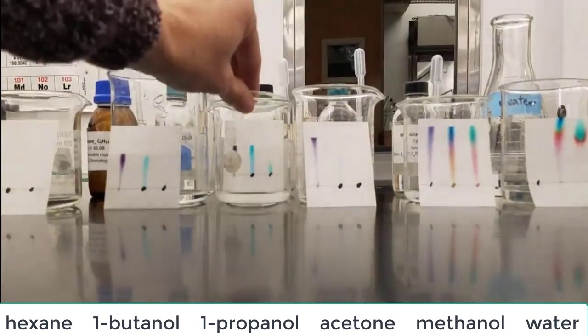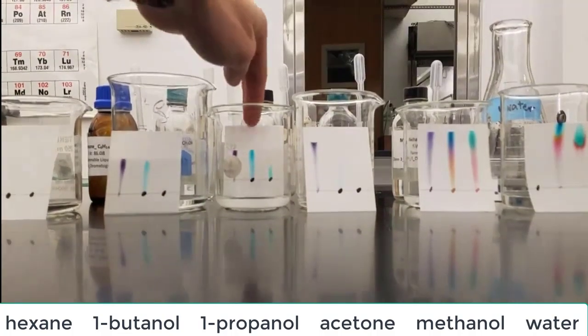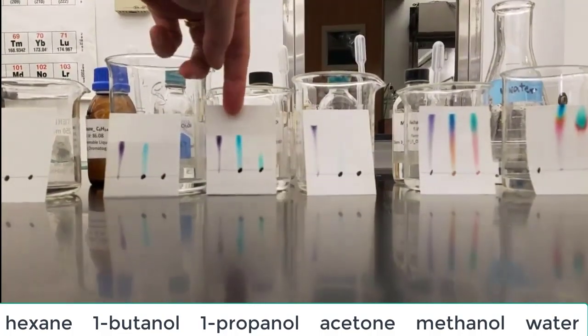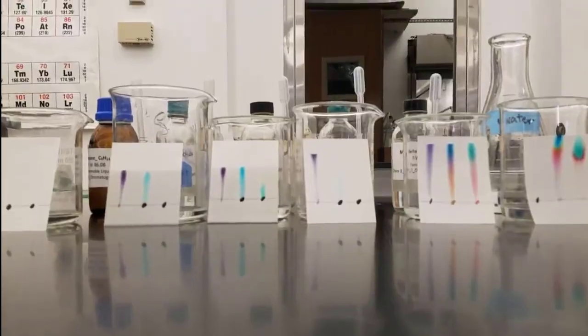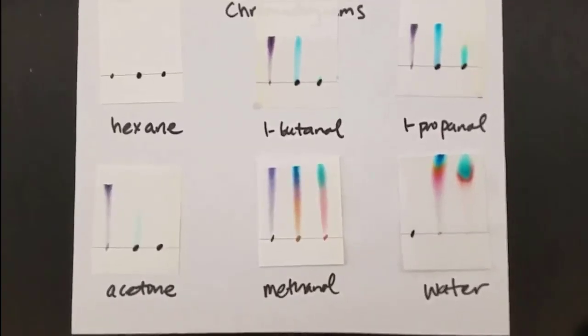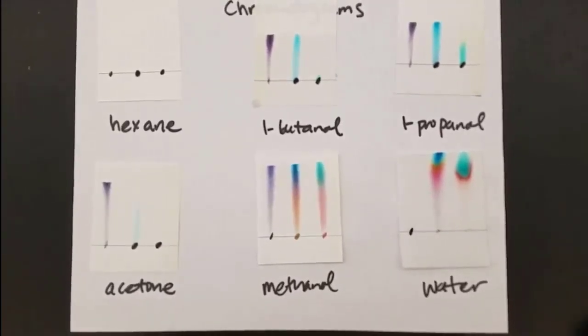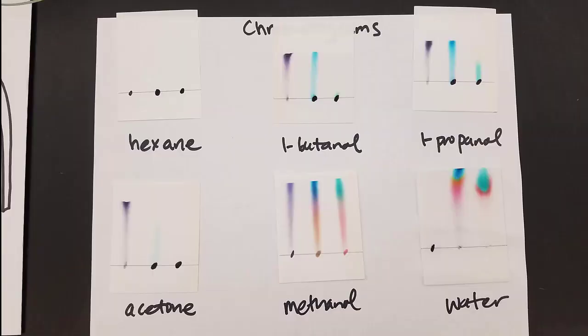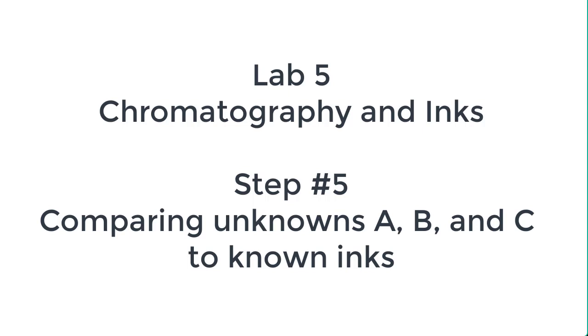Remember, these are the same three inks in every beaker: Sharpie, Crazy Art, and then Crayola. So you can pause this and record some of those observations if you'd like to. These go into your lab.